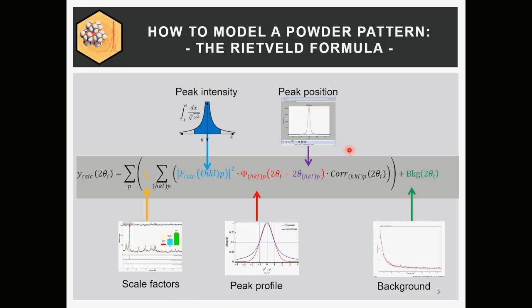and then you have a lot of correction functions. We talk about some of these, which is actually the crucial part in the Rietveld analysis. You have to think carefully what correction factors you will apply. A couple of these are geometrical, so we have to apply them. Others are actually facultative, so they're optional. You can say, maybe there's extinction, maybe there's this type of absorption, maybe there's this, maybe there's that. There are, of course, rules for this, and we'll look at some of these.